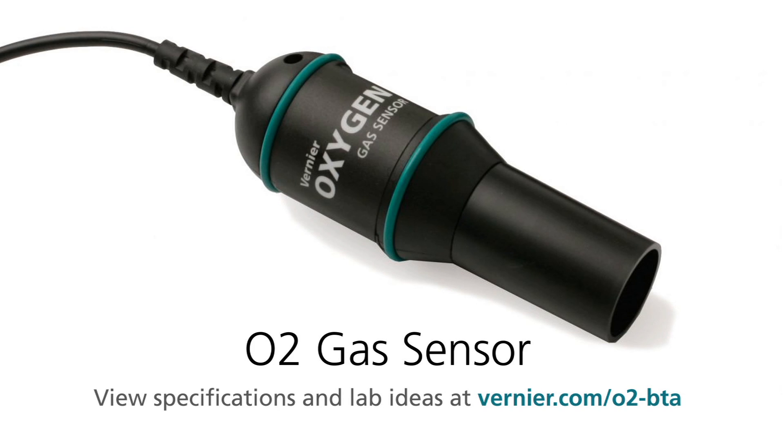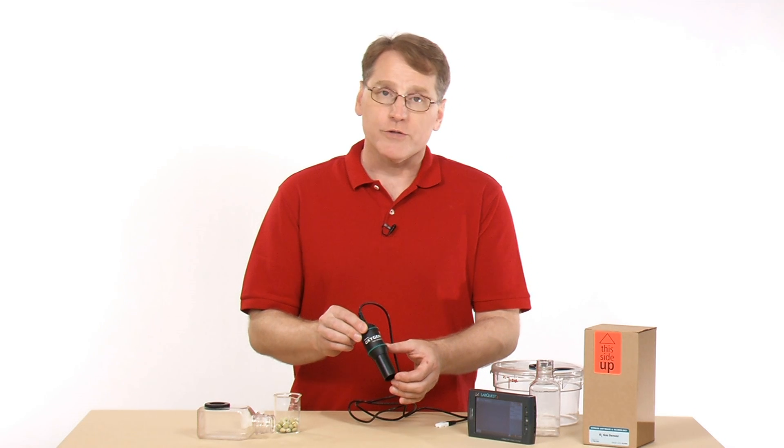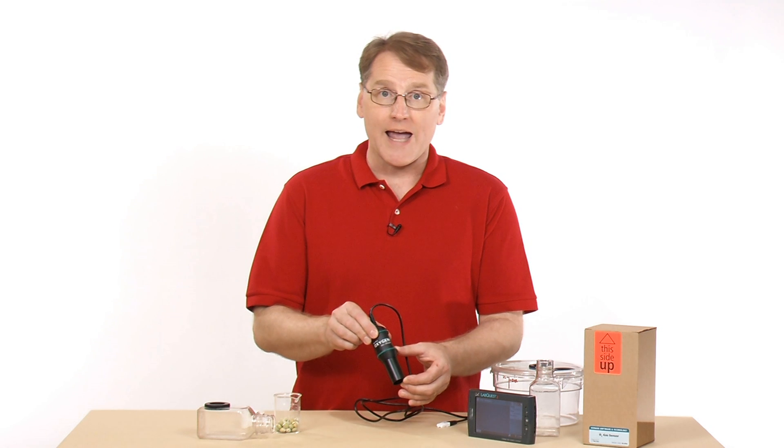And so there's standard biology, advanced biology, the inquiry biology book. And it measures the concentration of oxygen gas in the air.